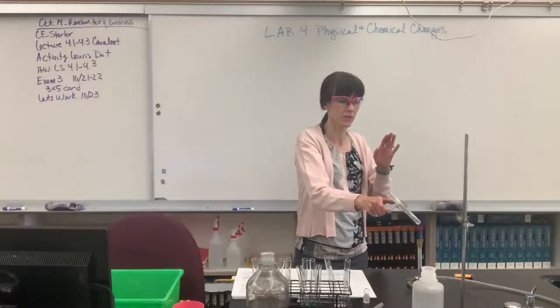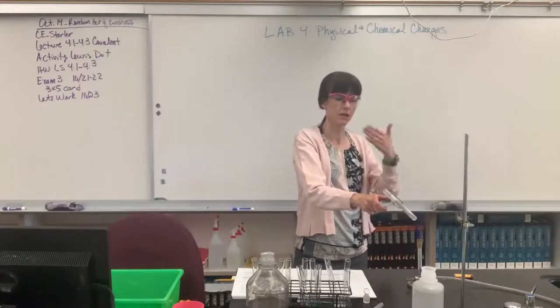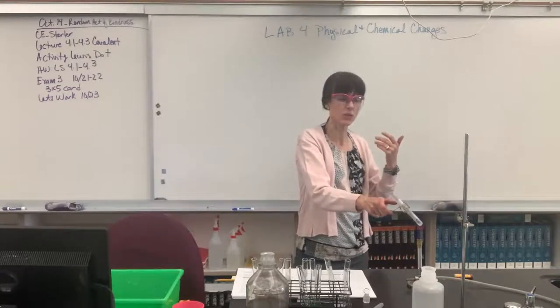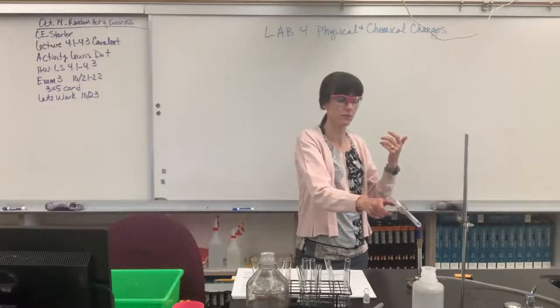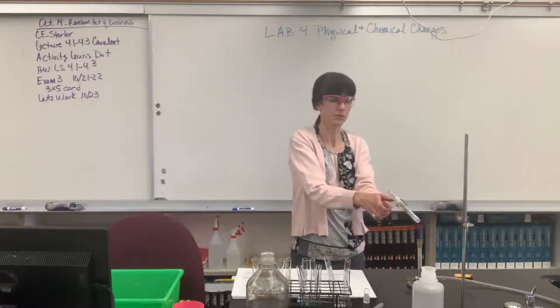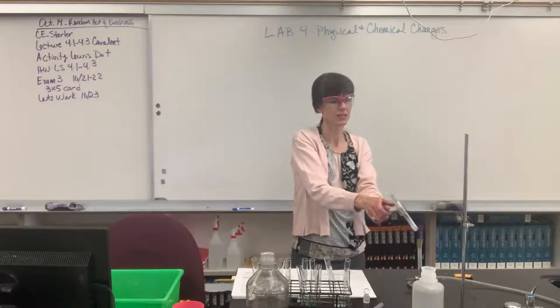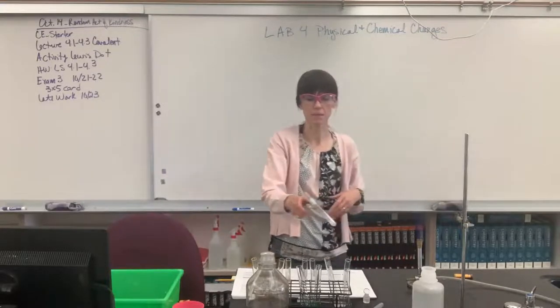Okay, just a little bit more time here. It's kind of forming a white powder on the inside of the test tube. So we're recovering the solid, getting rid of all the liquid. Oh, and I just heard that timer go off. I'm going to let this finish evaporating the liquid. Hoping you can see the steam too. So sorry you guys didn't get to do this. This is called wet chemistry, what we're doing, and it is a lot of fun.